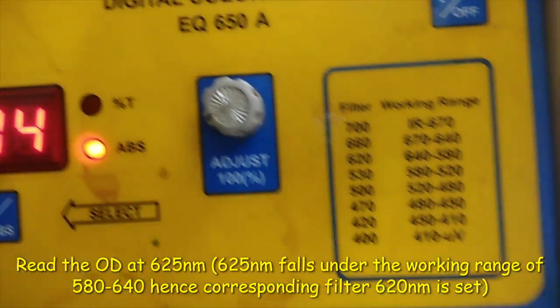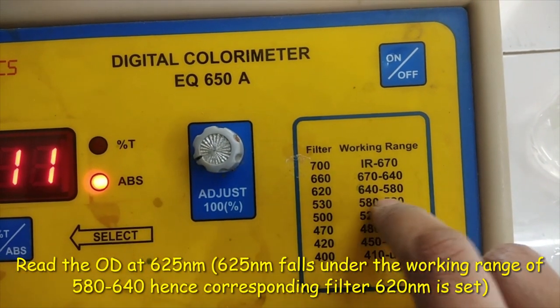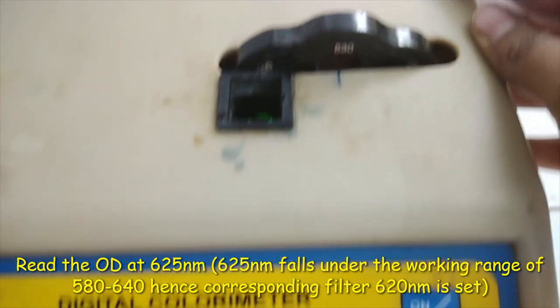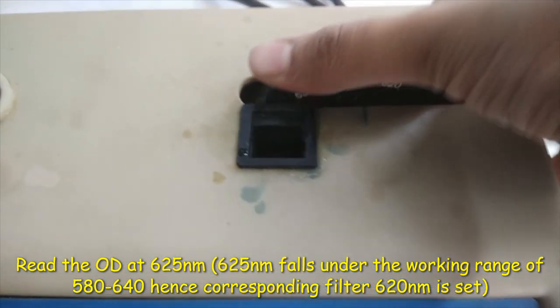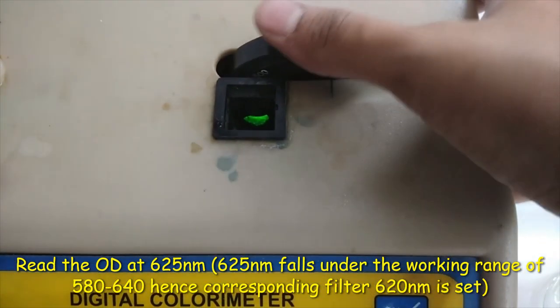After standby, read the OD at 625 nanometer. Here 625 nanometer falls under the working range of 580 to 640. Hence the corresponding filter of 620 nanometer is set.